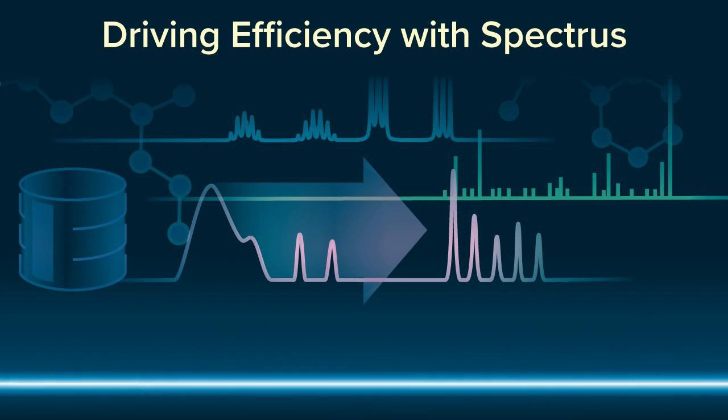The chemist can then complete the screen in the lab and create physical analysis plates. The data from these analysis plates is returned to Catalyst for processing and gives a visualization of data and helps chemists to identify the best conditions. So following having this answer, the chemist can then take that information and scale up their reaction or do with that information as they wish.